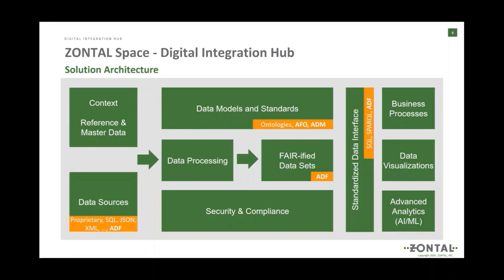And then we have different types of consumer applications. So we can feed the data back into the business process. For example, if we want to orchestrate the communication between instrument and lab informatics systems, we can use the standardized representation here to support this integration. We can integrate with data visualization applications or advanced AI and ML platforms.